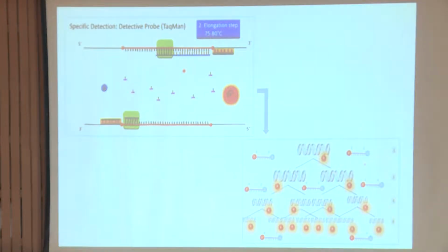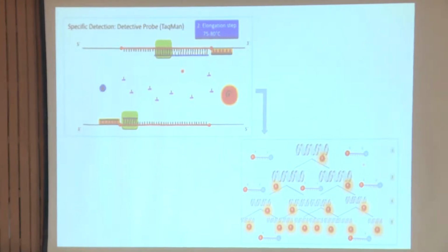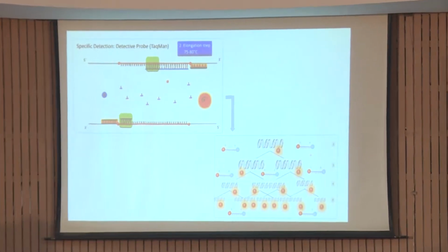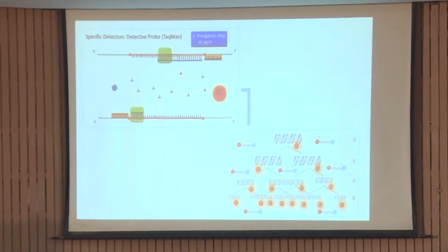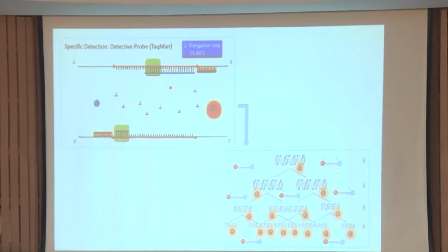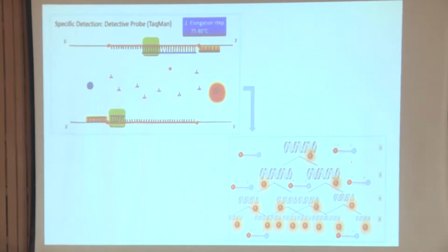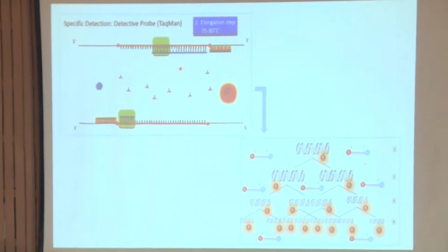This is the scenario. So after the run and before the run, what is the difference? Before the run, the probe was together. After the run, the probe is disintegrated into fluorophore separate, quencher separate, and the nucleotides which connected both of them separated, right?